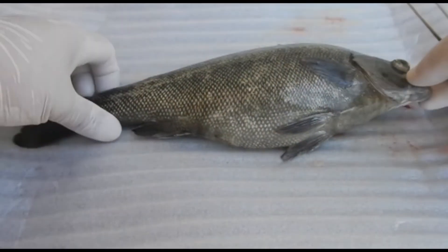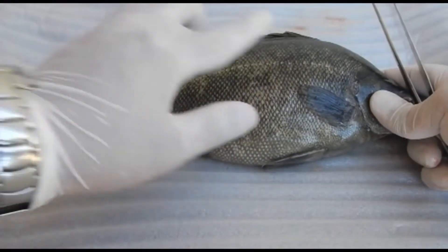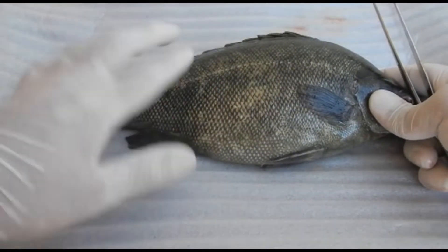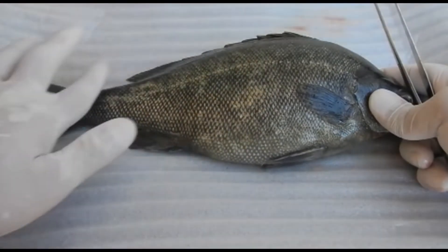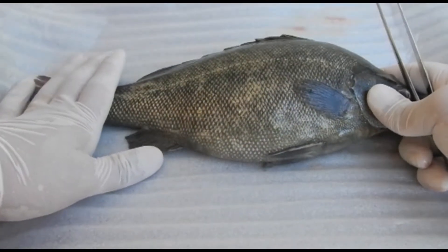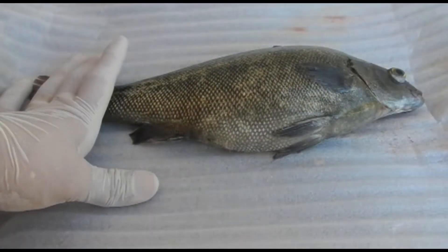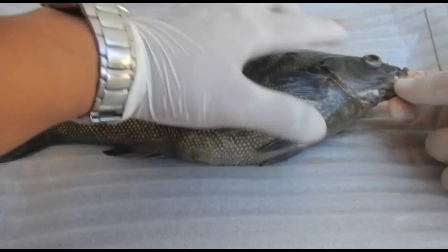Another thing you want to check with the fish is the skin — look for any lesions, feel the mucus, and make sure it's not sticky or too slimy. This fish has been dead recently and it looks quite okay. Next you want to check the eyes. They should be convex and shouldn't be sunken or exophthalmic.